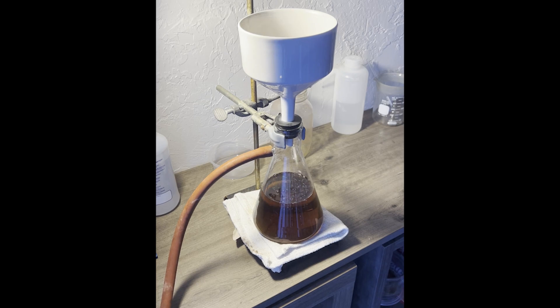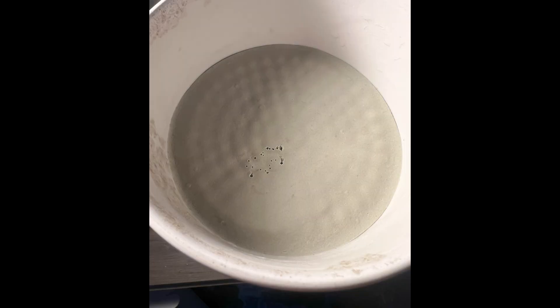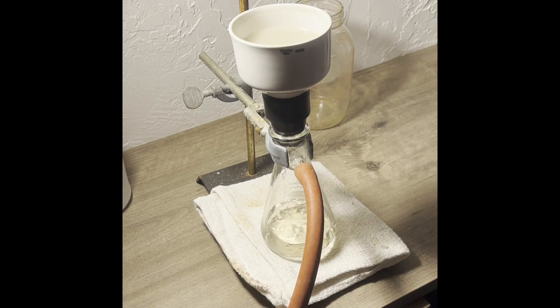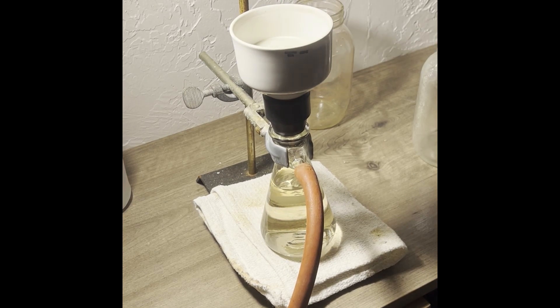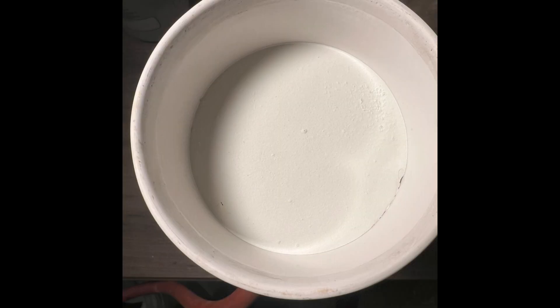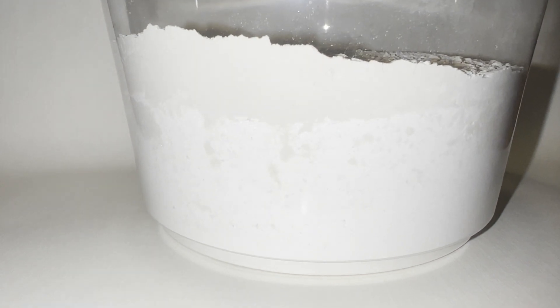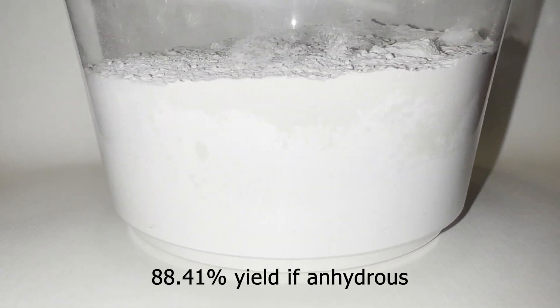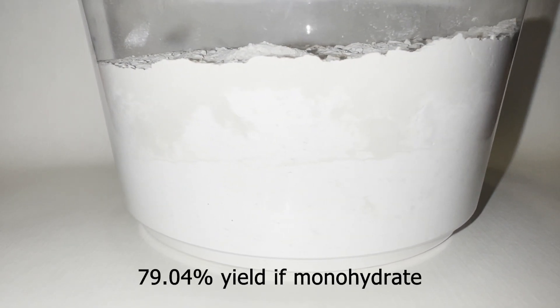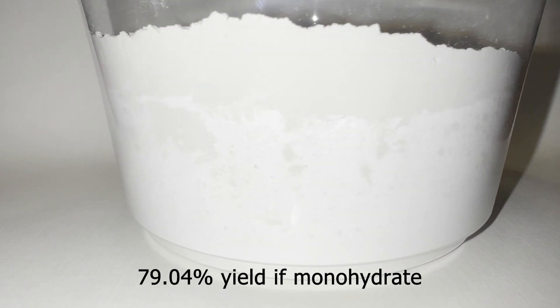This is the ferrous sulfate retained on the funnel, which I treat the same way as before — adding denatured alcohol and boiling on a water bath, then filtering. Here's the ferrous sulfate, slightly off-color but that's okay. I desiccated it the same way as earlier. Here's all the ferrous sulfate combined: 331 grams total, which is an 88.41% yield if it's anhydrous or a 79.04% yield if it's the monohydrate.